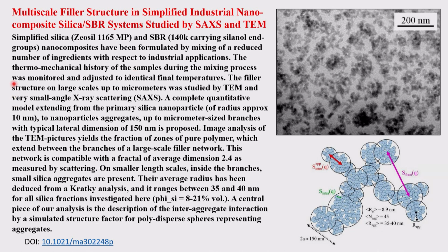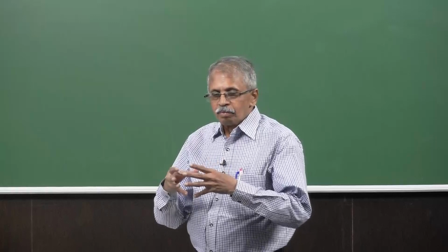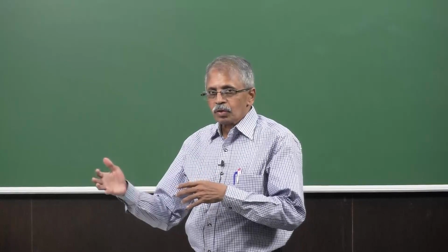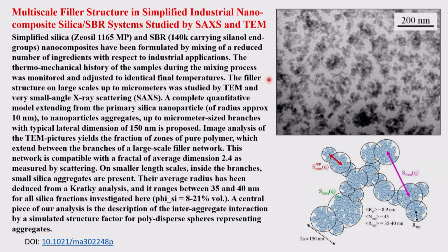These are basically thermal versus mechanical properties of that. So depending upon the structure, your thermal and mechanical information is embedded into that. Some of them will be thermally stable and mechanically strong. Some are thermally less stable and mechanically less sturdy, and so on. So they are dependent on what? The kind of aggregation, the kind of structure you have, and the composite that is formed there. That is where, what is it? The chemical composition, structural details, as well as size and shape, and all the elements present.